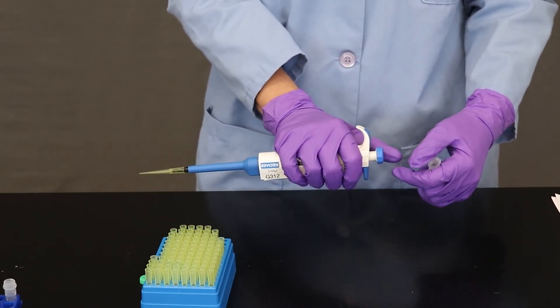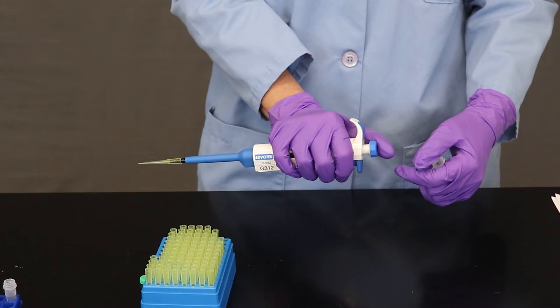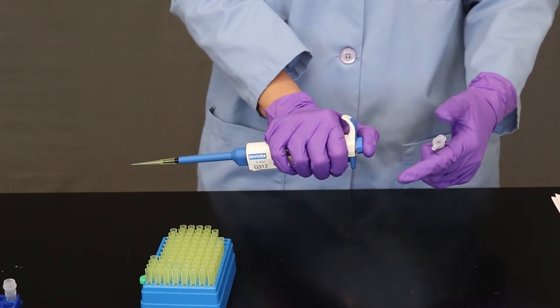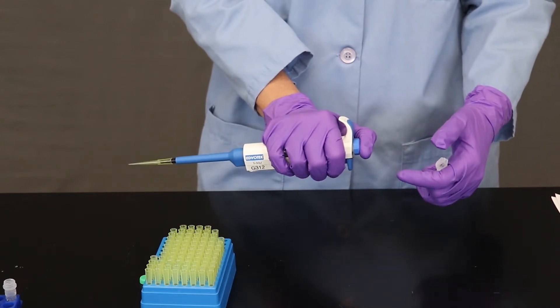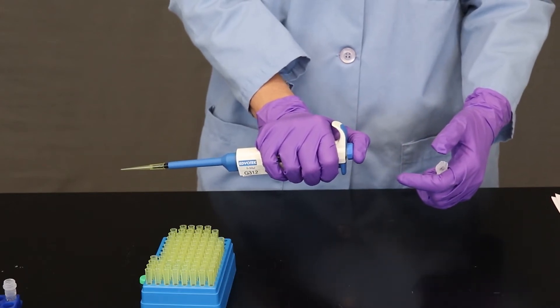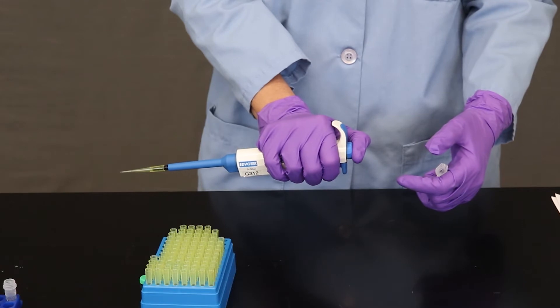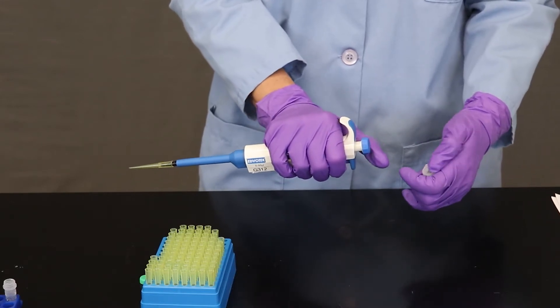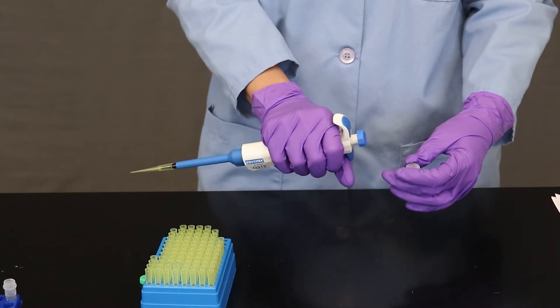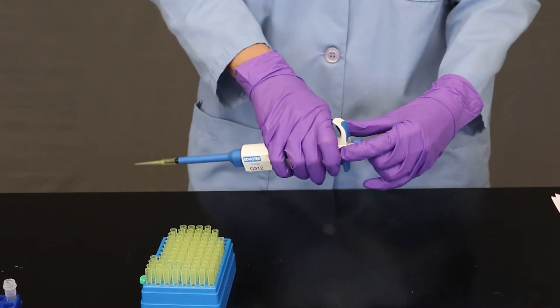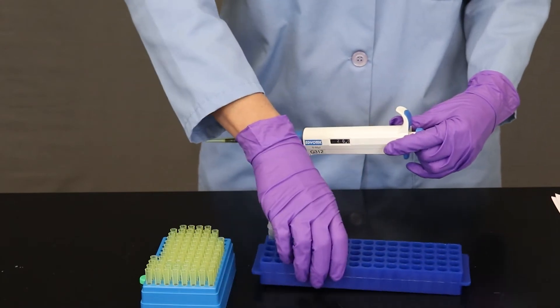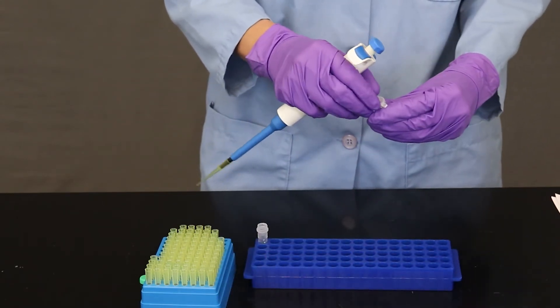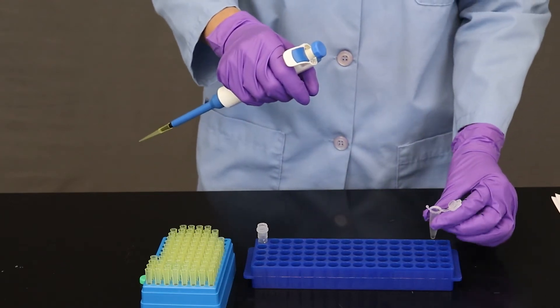Now the micropipetter, when you use it, it has two stops on this plunger, which is going to draw the solution up. So I've pushed down to the first stop, and then there's a second stop that I can push to. And when I actually pipette my solution, you'll see how these come into play.